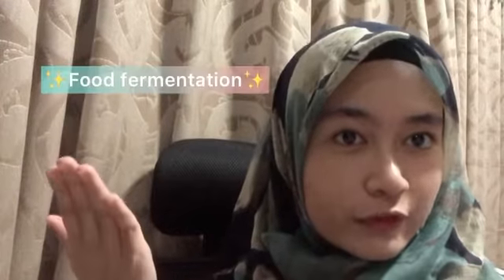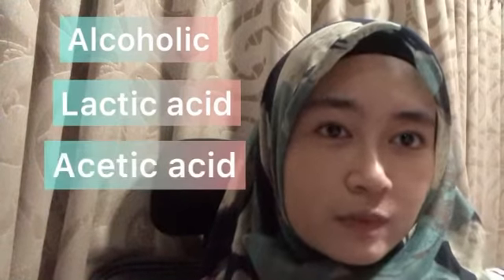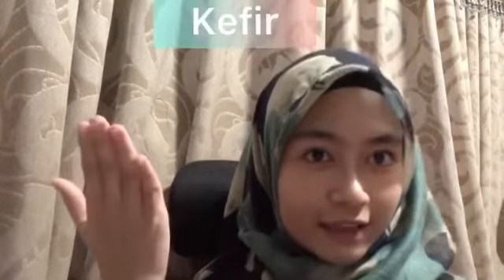What is food fermentation? Food fermentation is a process where bacteria or yeast convert food components such as carbohydrate into alcohols or acid. There are three main types of fermentation, which are alcoholic fermentation, lactic acid fermentation, and also acetic acid fermentation. In today's video, I will be focusing on the lactic acid fermentation of milk, which will produce kefir.